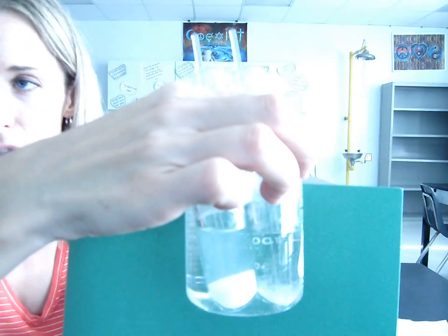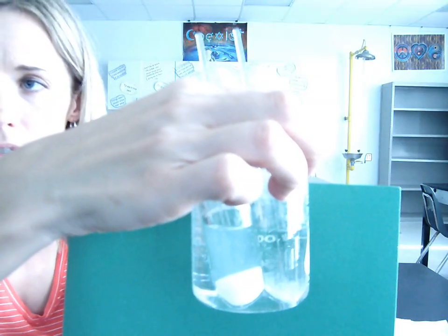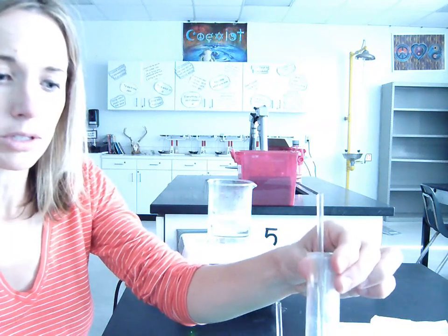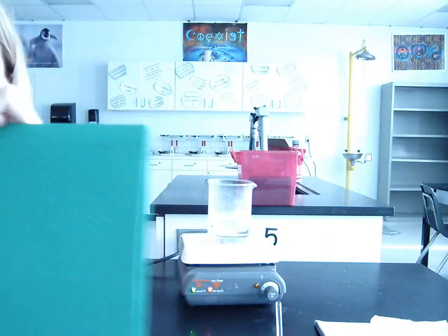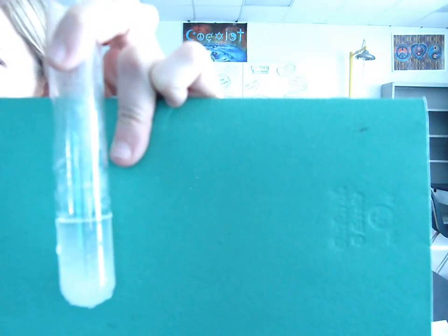Believe it or not, that's not actually a glare that you see. That is actual substance coming back out of the solution now that we're cooling it down again. Let me see if I can hold this up a little bit better for you to see on the camera. I need to have this in front of it, I think, so you can see it. Let's see. You see that stuff swirling around in there? And look at all the stuff that's coming back out of the solution.